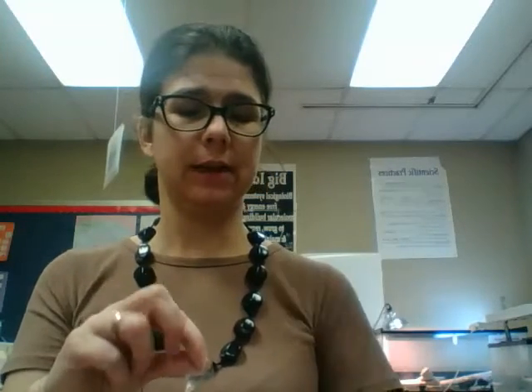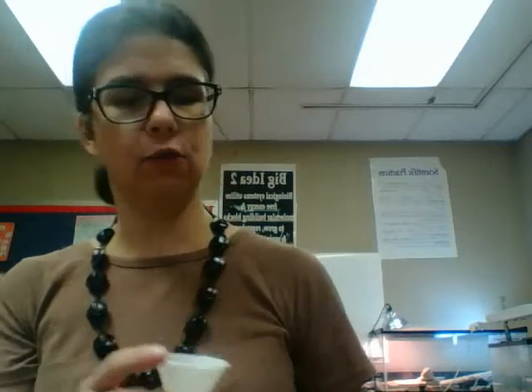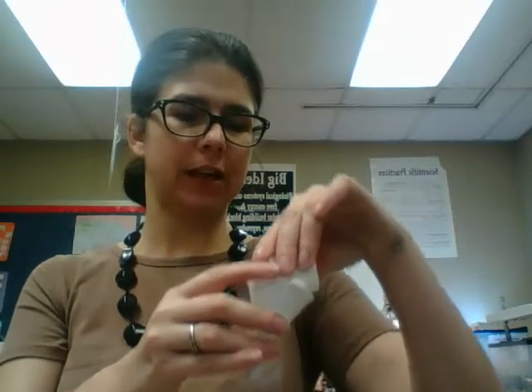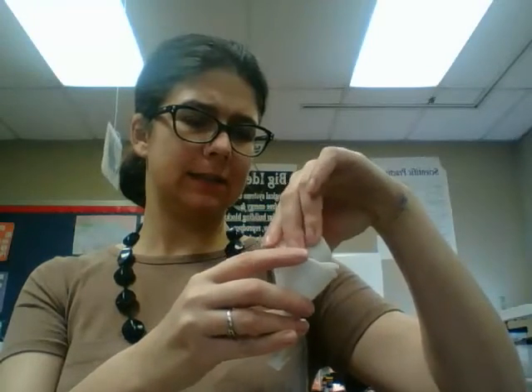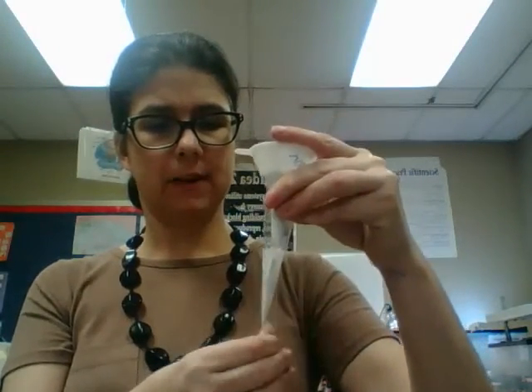For this activity, I have two funnels at the table — one is going to be used for the cornstarch. I might actually use a graduated cylinder instead. The funnel is going to go into the dialysis tubing once you get that little opening made. It says to use a half teaspoon or a teaspoon of cornstarch. You can use about a third of a cup, and just shake it through. Now it's wet on the inside so it's going to stick as it goes down — you may have to use your fingers to help loosen it all the way down.